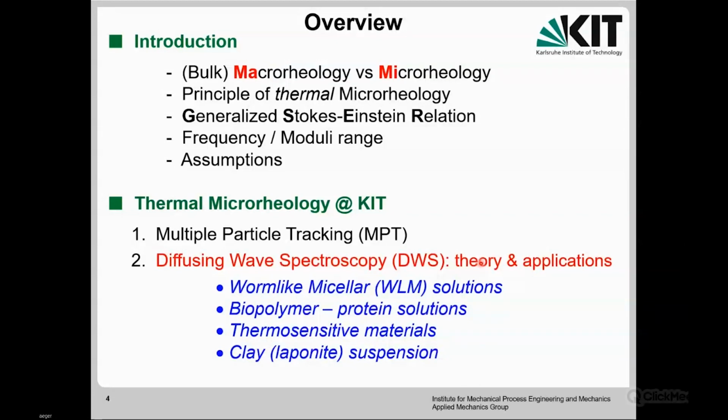For instance, since many years ago, we started to use this technique on worm-like micellar solutions, and also biopolymers like hyaluronic acid and protein solutions. We also investigated thermosensitive materials. You will see what information you can get, and also suspensions. It was clay suspensions. So I would say four classes of different materials using this microrheology technique.